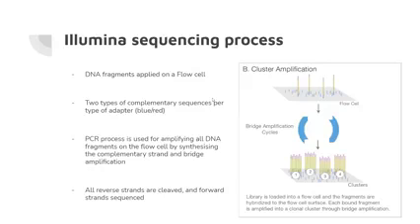So next we have this plate called a flow cell, and sticking out of that plate are little pieces of DNA that is complementary to the adapter sequences that we put on. So the adapter sequence at the bottom of the fragment binds to this adapter sequence on the flow cell. So what you end up with are these fragments here sticking up from the flow cell. And we're only interested in one specific direction of the DNA strand.